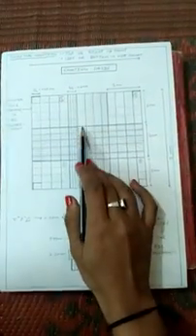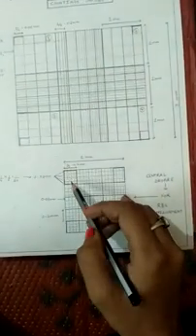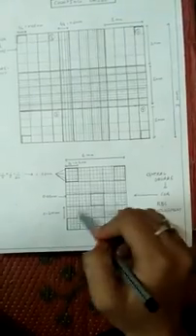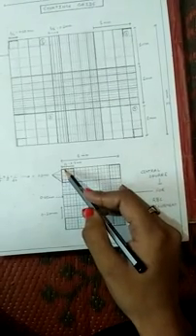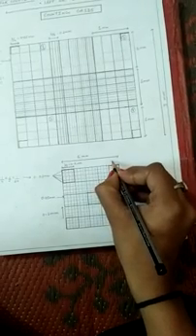But here in this middle central square, if we further magnify it, then here you can see that this whole is one central square which further has 25 small squares, and one small square further has 16 small sub squares. So the area of one small square will be 1 by 5 into 1 by 5, which is equal to 1 by 25 square. If we assume that this is 1 by 5, then this will also be 1 by 5, then the area will be 1 by 5 into 1 by 5, which is equal to 1 by 25 square.